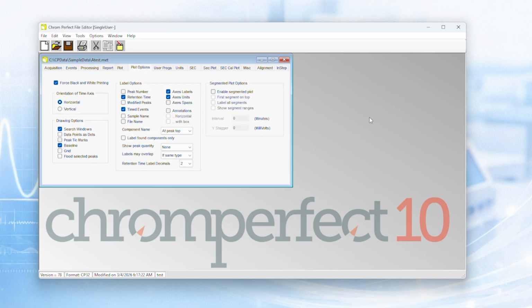Next is the Plot Options tab. Plot options define additional display behaviors, such as labeling and visual presentation elements. These settings mirror options available in the Analyze program. Again, these are presentation controls. They do not affect raw data or integration logic.